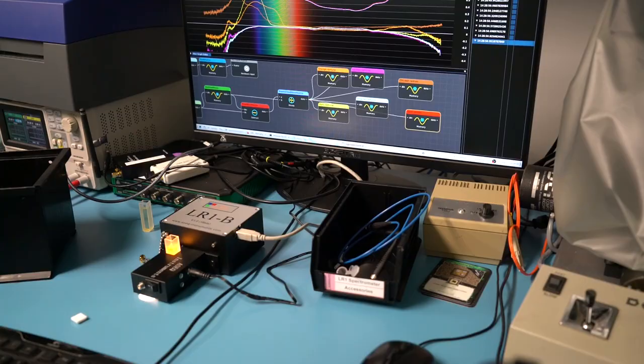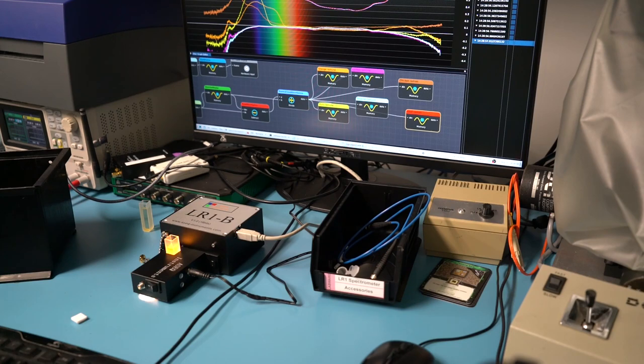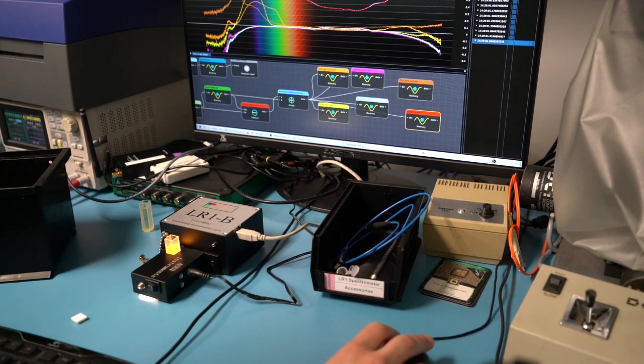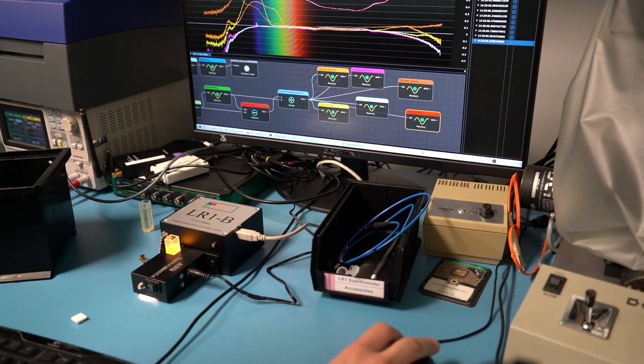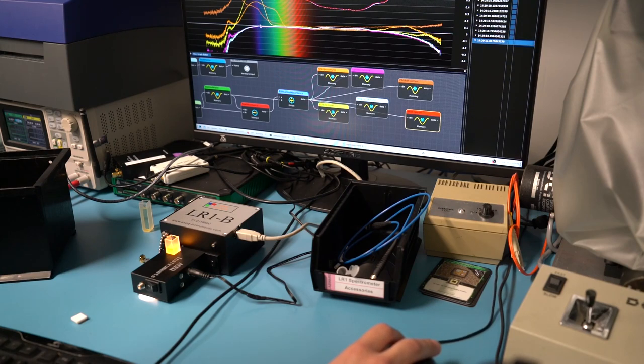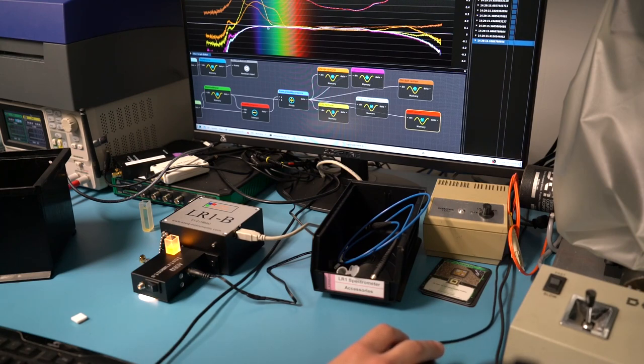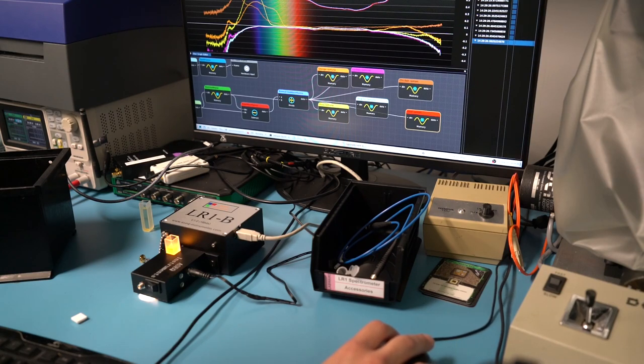I think that's a wrap. We've measured four different flavors of Ramune and two flavors of ramen and got spectra from all of them. It's pretty clear that the ramen spectra of chicken and beef are very different. The Ramune spectra of Yuzu, orange, and original are very different. But unfortunately, lychee and original are so close that we can't really tell them apart with this instrument. You'd need an instrument with more dynamic range to really do good Ramune spectroscopy. But for ramen spectroscopy, the cheap little unit I've got here is more than adequate.